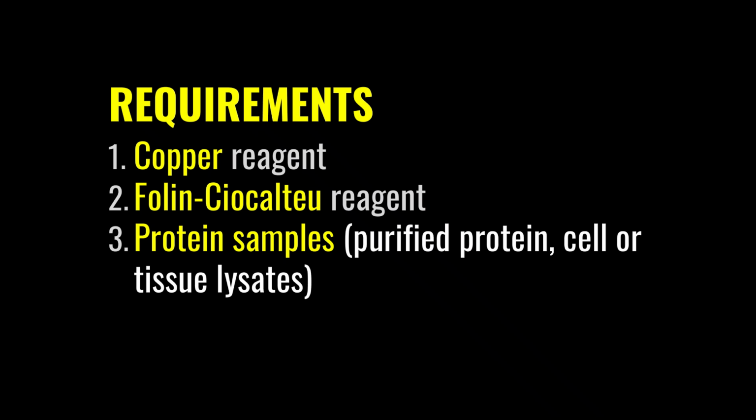I have been using this method commonly, and the success of your experimentation also depends to a larger extent on how well your protein sample is prepared. So I will discuss this issue also, and I hope that will help you. And the last one is the spectrophotometer. You should know the basis of the spectrophotometer, and if you don't, please read about Lambert's and Beer's law. That will help you to understand this.